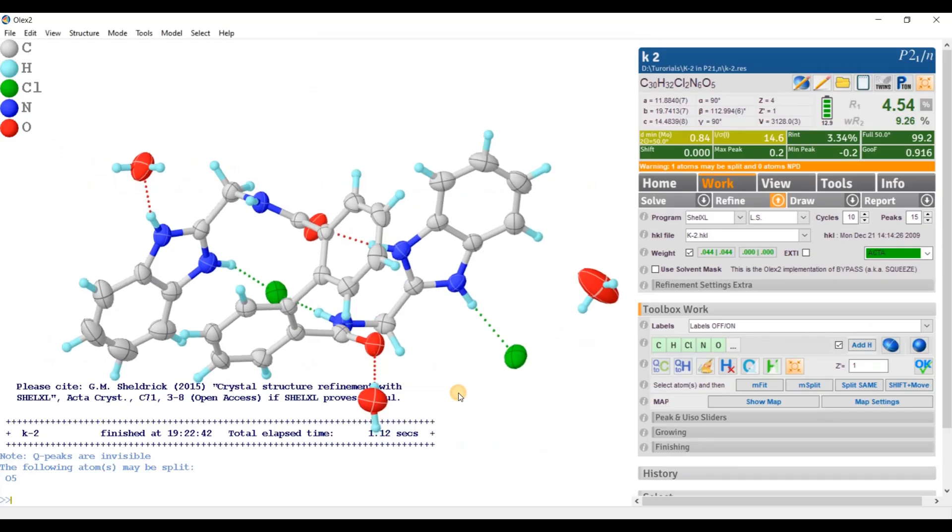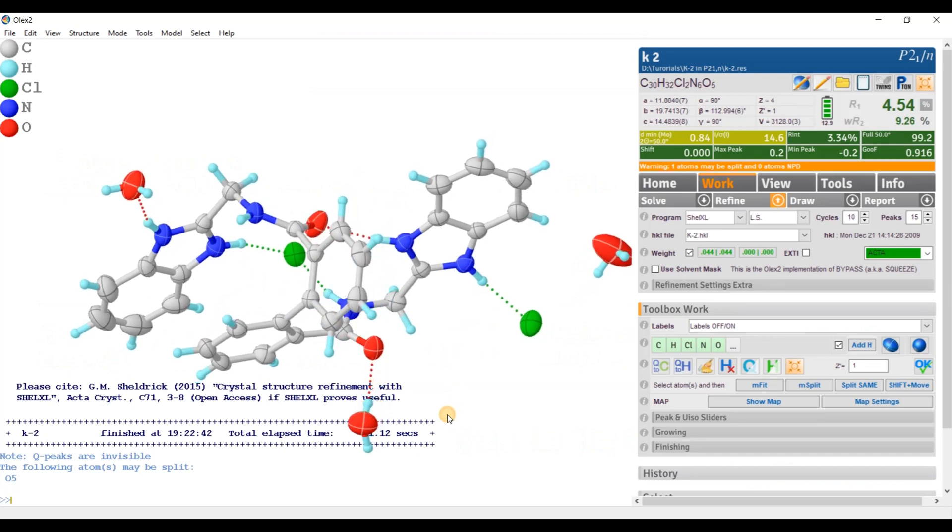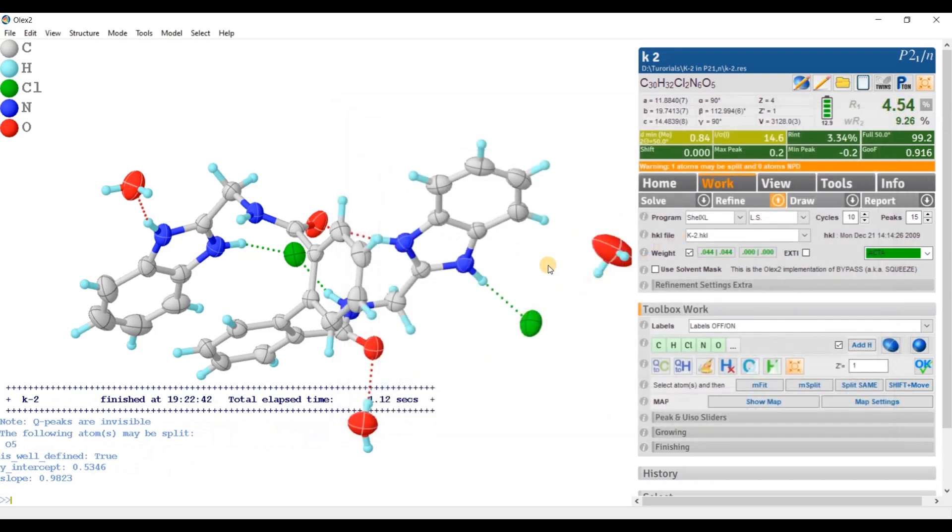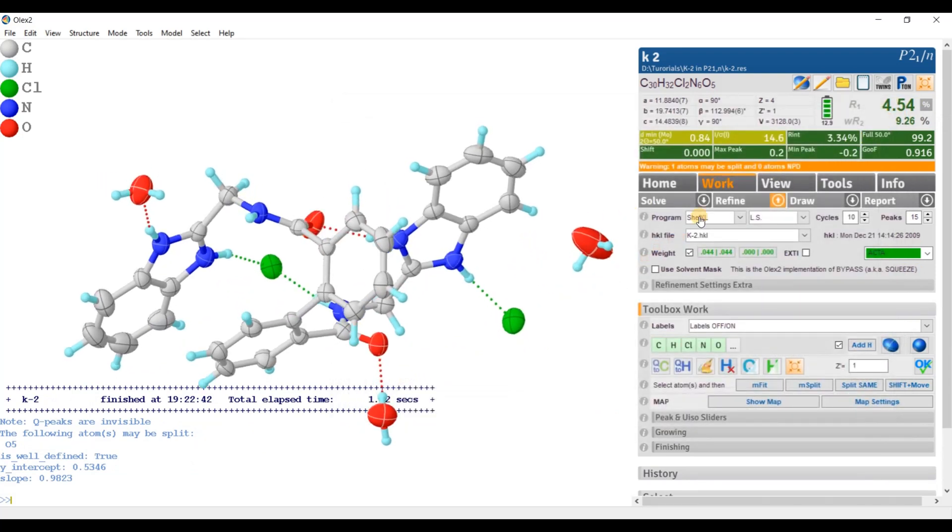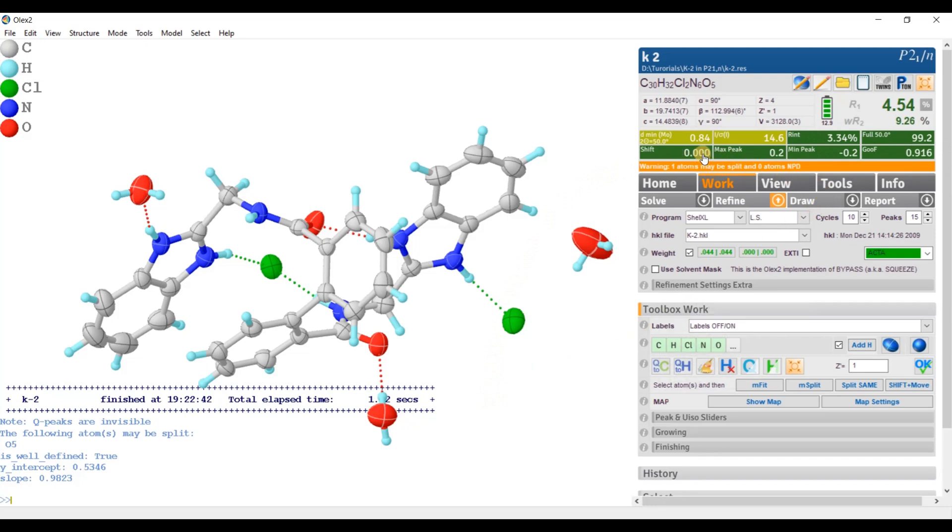Okay. So this is the finally solved structure in space group P21/n, which is a non-standard setting. The final R factor is around 4.5% with very nice looking F observed versus F calculated graph. The maximum and minimum Q-peaks are quite reasonable. The merging R factor is very nice, it is around 3.34%.